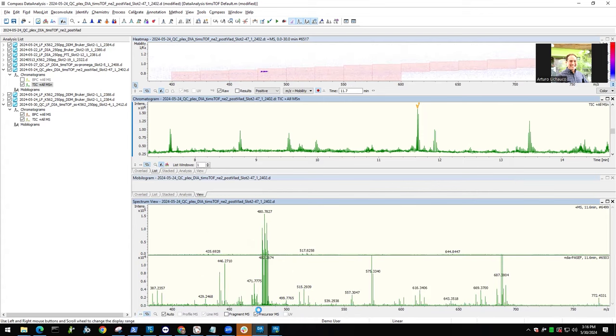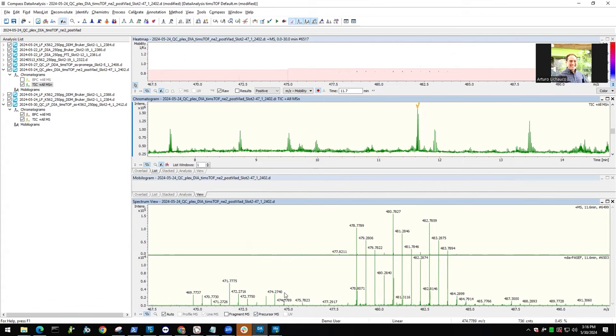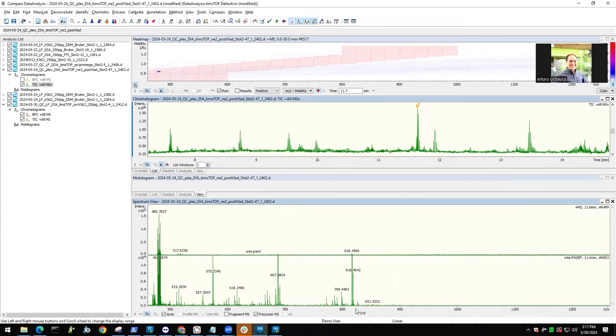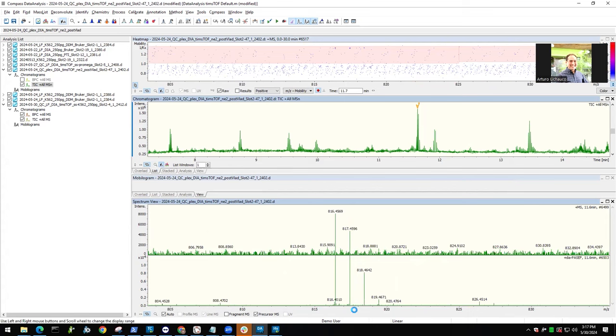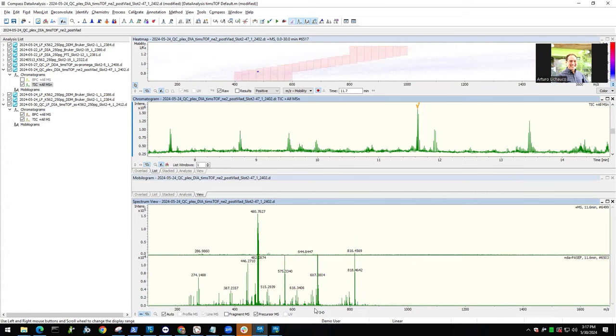We try to analyze everything that's in here, and you see that your precursor is still intact, but you also see that some of your fragments, these are water losses or things like this, also come in the pattern, right? And even here, for some fragments, you don't see the actual pattern. You only have a label on one side or on the other. So this fragment then is not distinguishable from the three mTRAQ labeled peptides. So you have to make sure that your software understands how it looks. That's why it needs those settings.